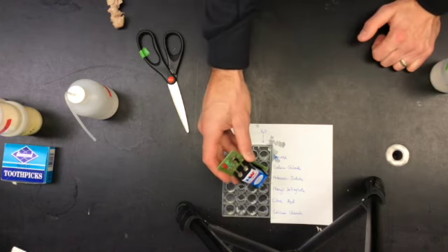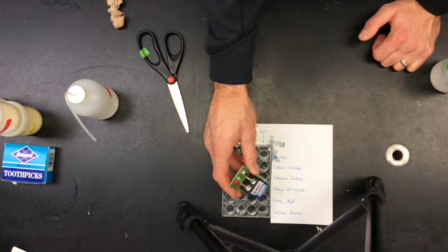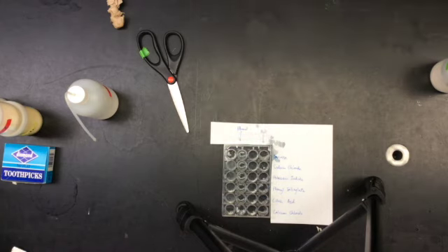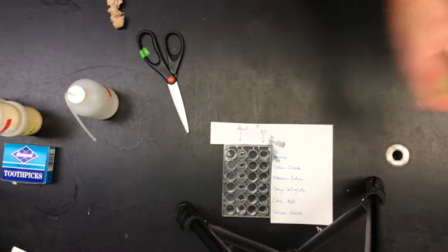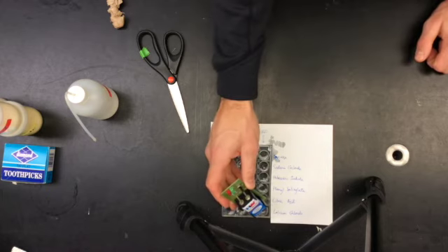We're now going to test the phenyl salicylate. One more time. Now the citric acid. And we can see the light comes on there. And our last solution, the calcium chloride.